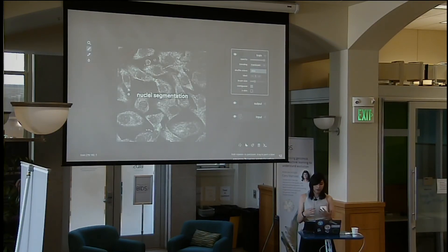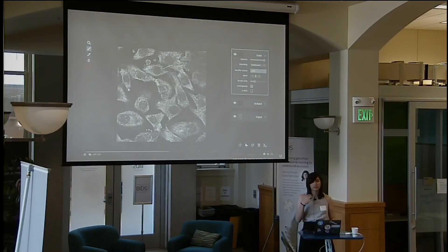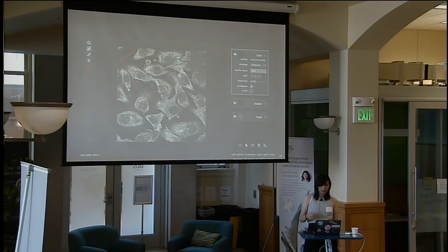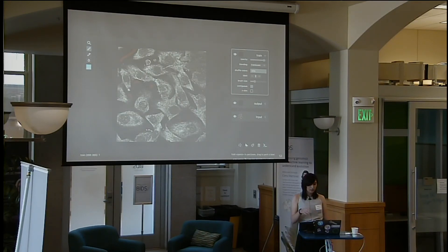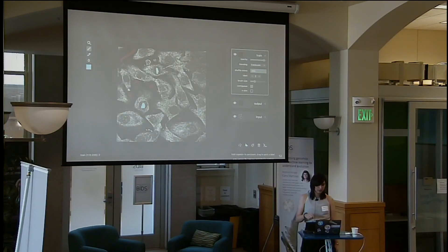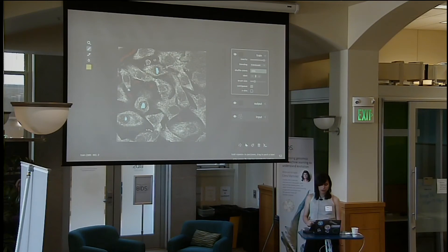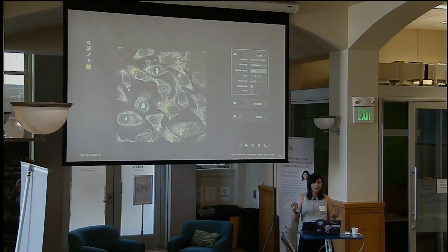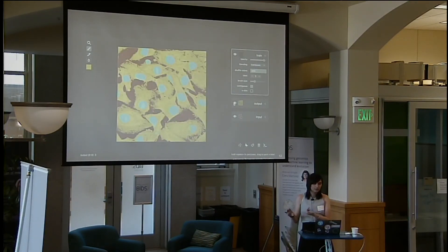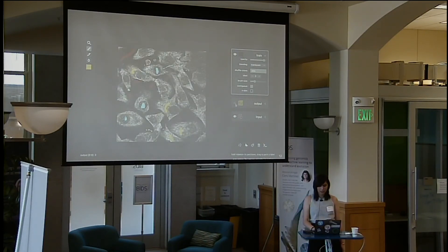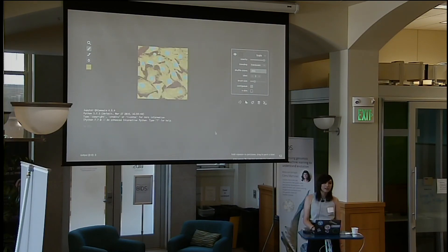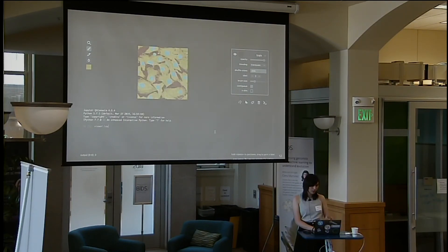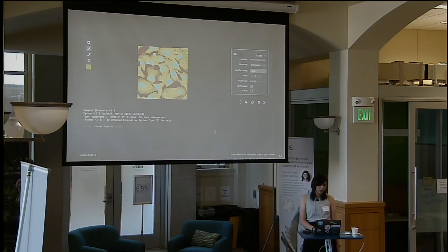Now we're going into nuclei segmentation. This is a more complicated example of using custom shortcuts and key bindings. We're going to be labeling the background of this image and the nuclei, and then run an algorithm on this — it's going to automatically segment all of this with the press of a single button. This is using a library called Segmentify that's built on top of NAPARI. You can open up the IPython terminal here and get your output back out.